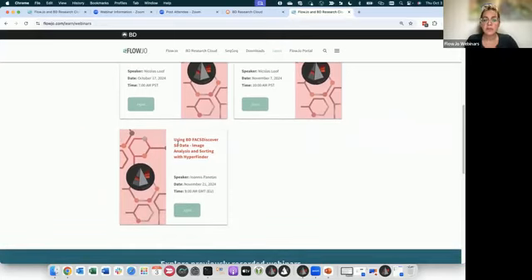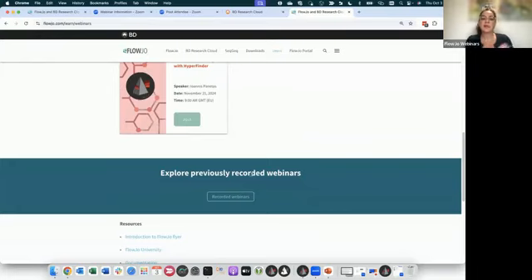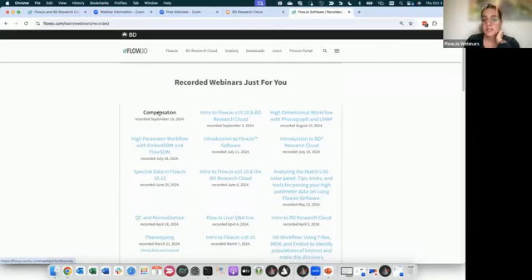This will be about FACSDiscover assay data analysis, but if you are more at, let's say, a starting point with FlowJo, you can go on all the recorded webinars and find, for example, a specific webinar on compensation. This was done only on compensation, starting from the theory and then going on to all the practice and all the different examples of compensation that you can have in FlowJo. Or, for example, introduction to FlowJo. These are basic webinars, or high dimensional analysis webinars.